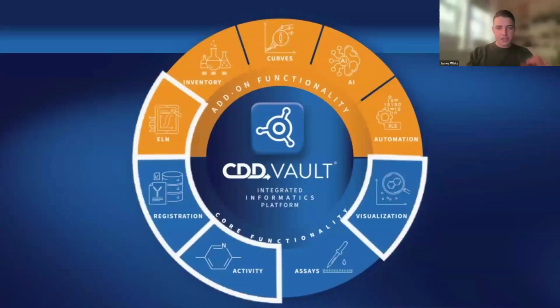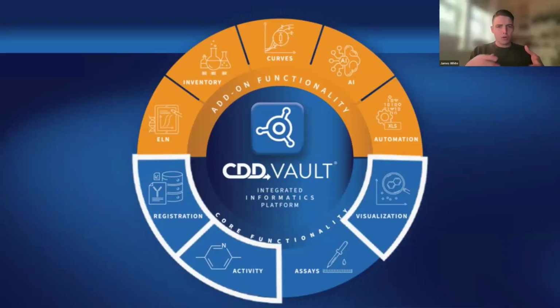So let's kick it off with the latest developments in biologics and bioconjugates. These are playing a much larger role in modern research, and the industry is expanding, so we've brought those tools into CDD Vault so that you'll be able to take advantage of them. We've added intuitive registration for complex biologics, including antibodies, peptides, as well as bioconjugates, flexible representations of the linkers and payloads, and modifications on those bioconjugates, as well as clear visualization of the constructs, enabling you to review and share those structures at a glance for streamlined collaboration.